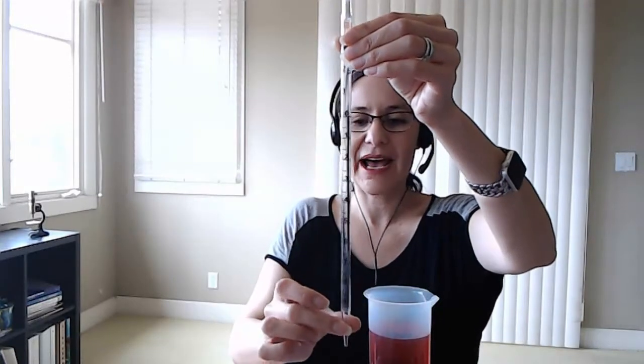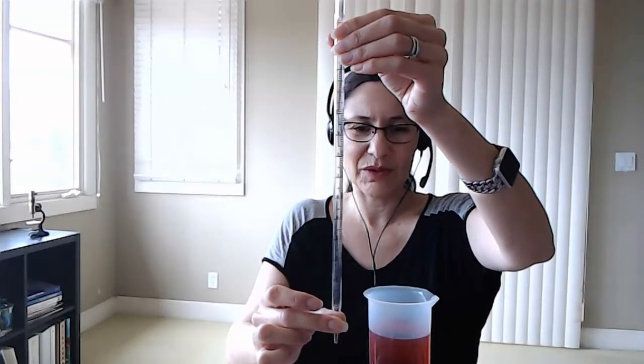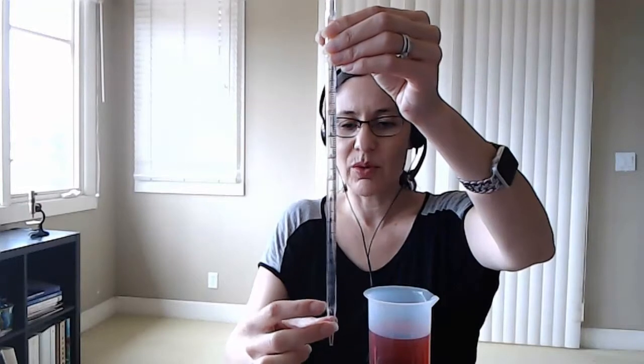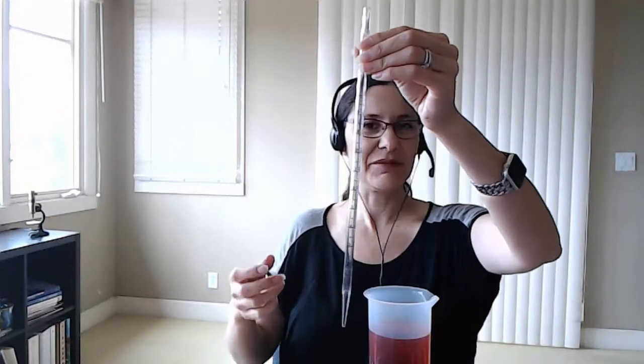However, these pipettes do have the graduations in what students would think is more the traditional way, which is 1 ml, 2 mLs, 3 mLs. But you can barely see these graduations because in a research lab, we don't use those to measure the volumes. We use the opposite, if you will, as we release the volume. So the 10 ml and the 5 ml pipette have the graduations listed in both ways. It's going to be up to you how you want to use that.